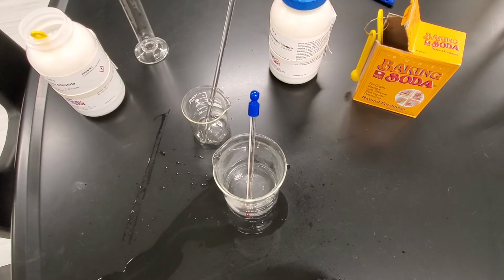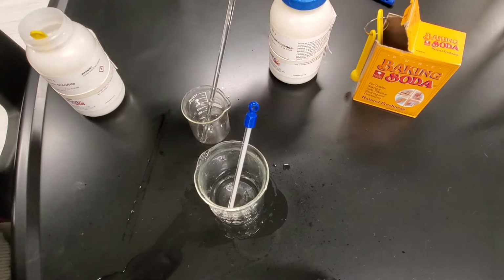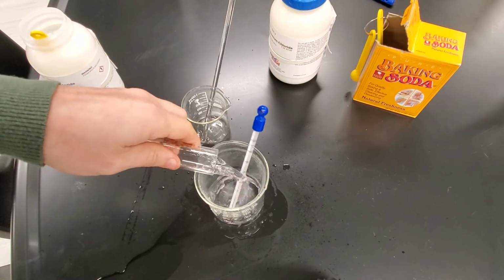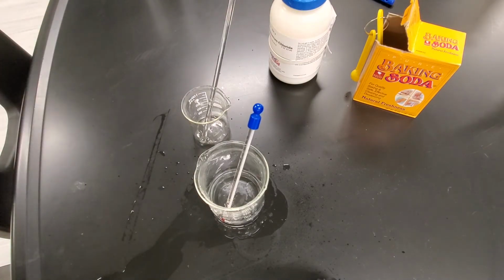I'm going to go ahead and clean this up real quick, and then we will proceed with the final combination. All right, so we got it all cleaned up. Again, we are going to be using 50 milliliters of water. At this point, I don't think it will be any surprise as to what the beginning temperature is going to be. Hopefully you've noticed that there's actually a pattern to the starting temperatures.